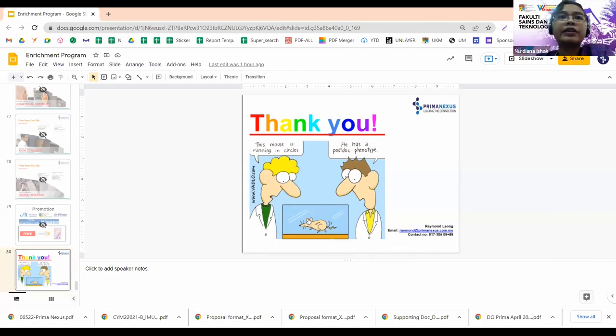Okay, so we move on to the next question from Alia Najiha. The question is, if the food intake is concerned in the experiment, will the gnawing material affect the experiment?